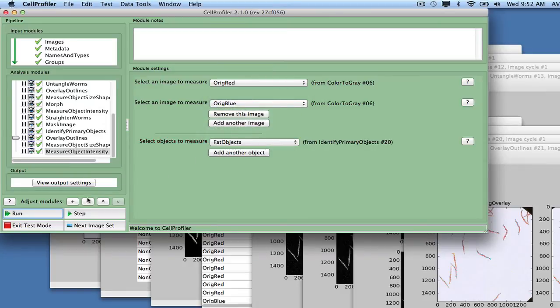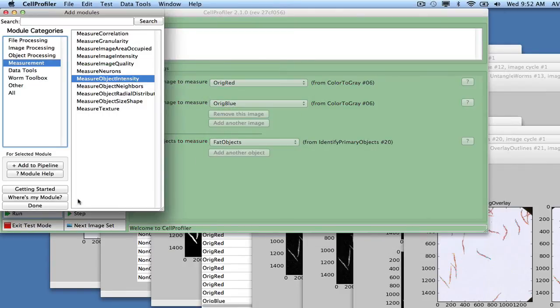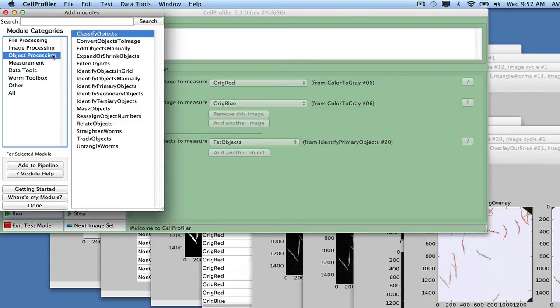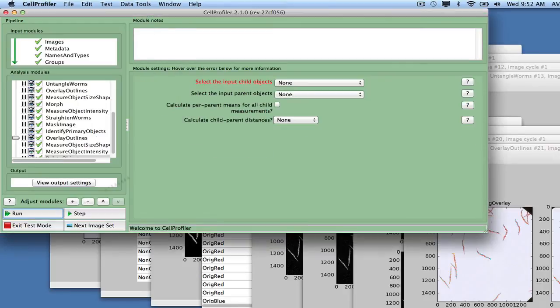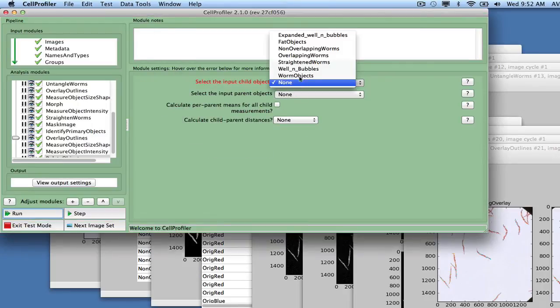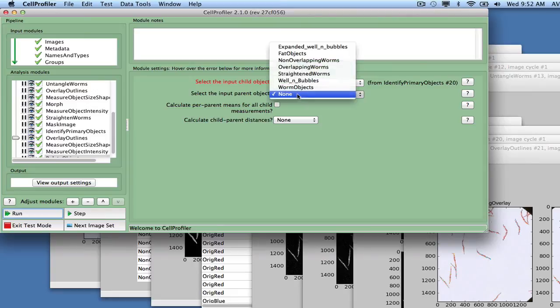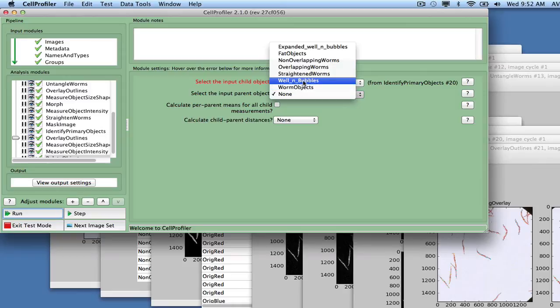In order to assign each detected fatty region to a worm, we add the module Relate Objects, with fat objects as the children and non-overlapping worms as the parents. We also check the Calculate Per Parent Means For All Child Measurements box to aggregate the fat statistics for each worm.